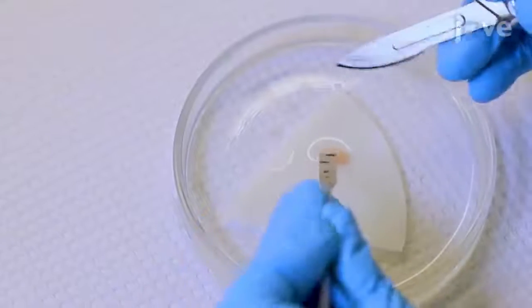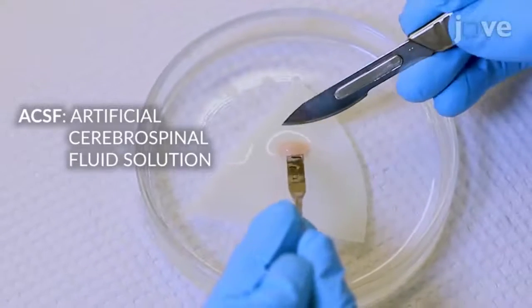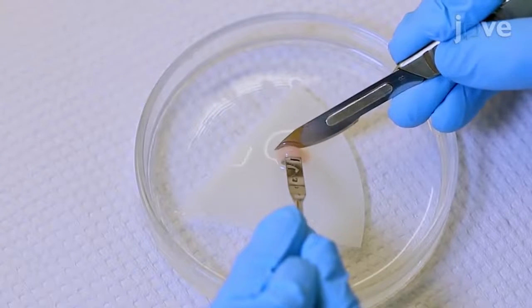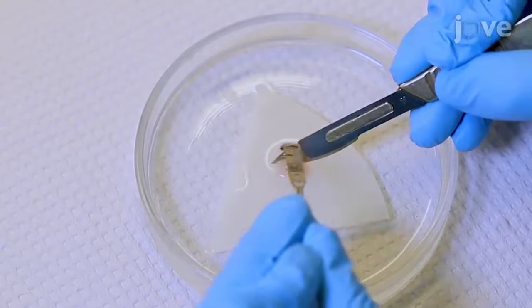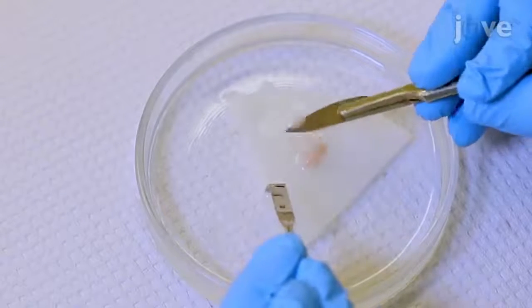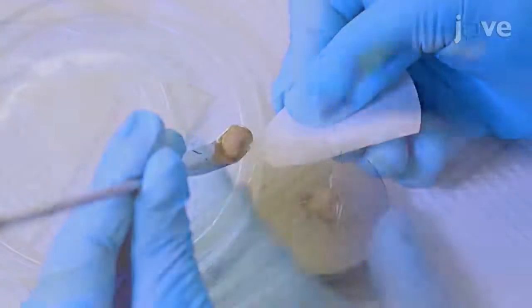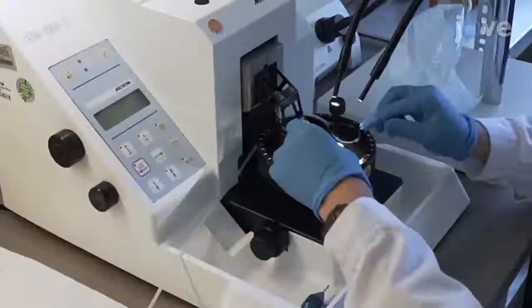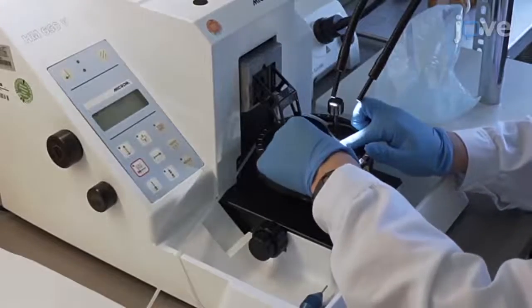In an ice cold petri dish filled with ACSF, place the brain on a filter membrane. Separate the hemispheres and perform a parasagittal cut at an angle of 45 degrees. Fix one hemisphere at the vibratome tissue stage with superglue and immediately transfer the tissue block to the vibratome bath containing ice cold ACSF.